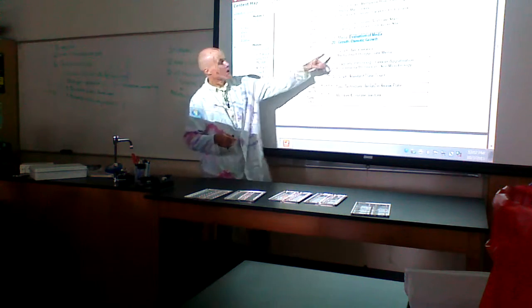Which tube grew more? I could have A, B, C, and they'll be labeled. Evaluation of media, I will have those 4 media, GSB, ISB. So I'm not going to make it hard for you to just have 4 random tubes and say, you're supposed to know this is a comparison of media. I'll have those on there. So what was its purpose? Well, what's the purpose? You work on it.